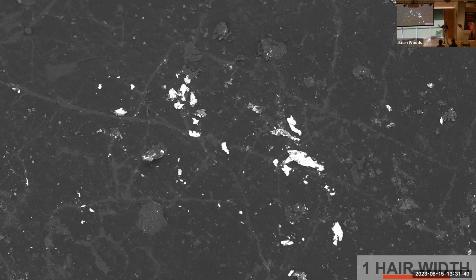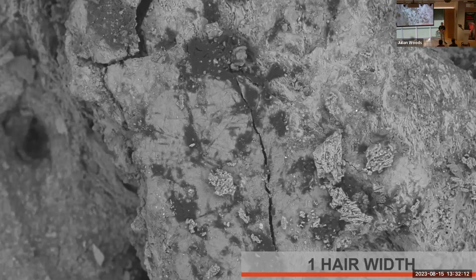So not only can we use it to look for different salt structures and different elements, but we can look for impurities and contaminants that might be on a surface. And these might have come not from where the sample was made, but also from previous treatments that a museum might have done before they give the artifact to another museum. Because like we've said before, we want to get rid of the mold. Maybe there's been a treatment that's been done to reduce that. And not only that, we can better map areas on the sample that might throw us off the scent if we're trying to investigate the elemental composition a bit more, like dirt on a piece of bone, for instance. So backscattered electrons really inform us on the different elements that make up a sample.